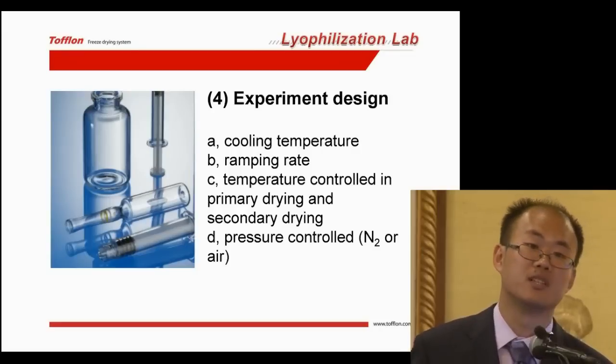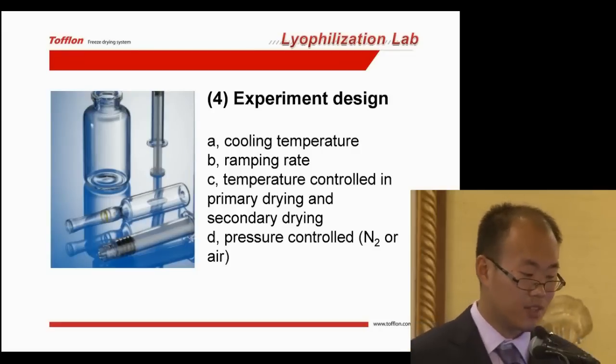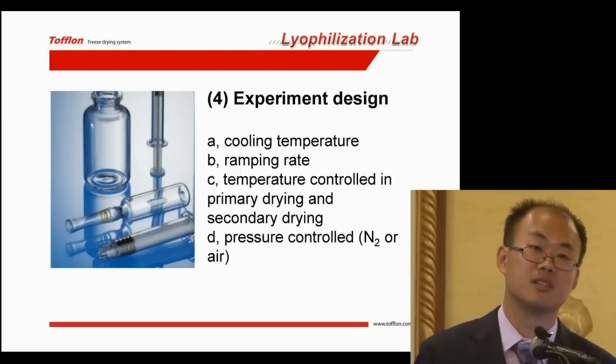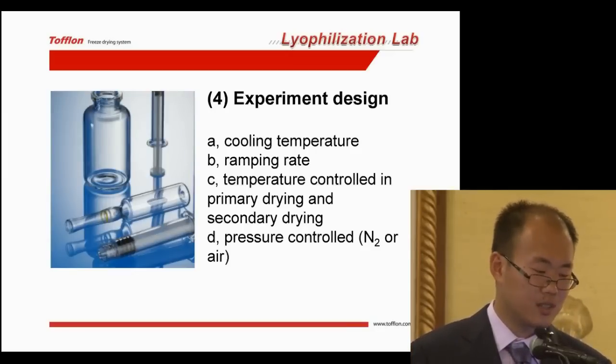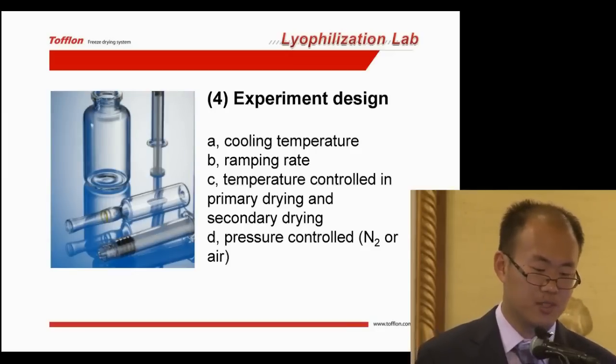And the ramping rate can give us a good structure of the drug solution. Usually for the ramping rate, we perform either fast cooling or slow cooling.